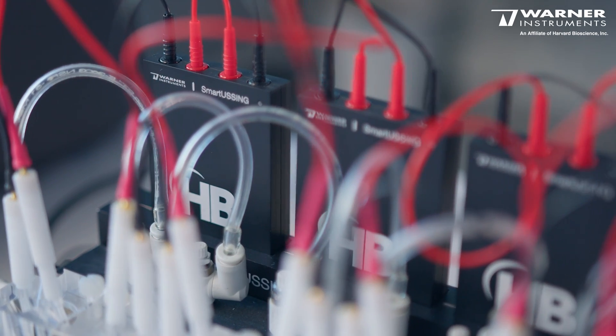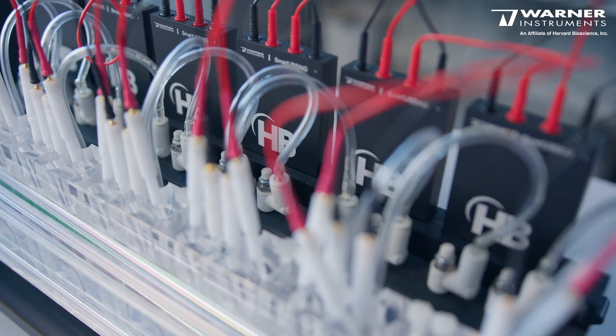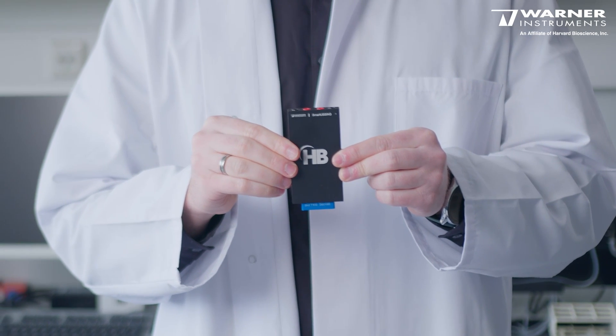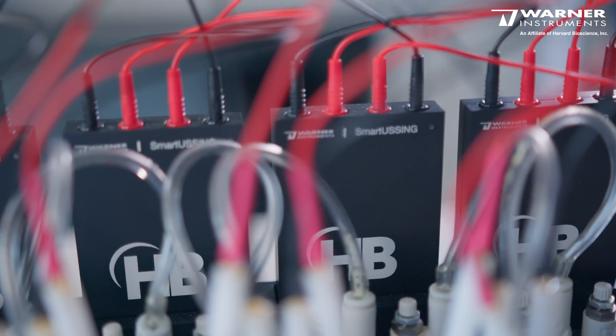So what exactly makes Smart Ussing different? First, the equipment. The traditional Ussing setup requires a holder for the Ussing chambers as well as a stack of analog amplifiers together with data acquisition boards. In our new Smart Ussing setup, we have incorporated these into smaller but equally powerful amplifiers, which are connected directly to the back of the Ussing holder.